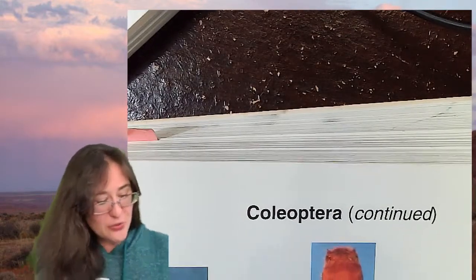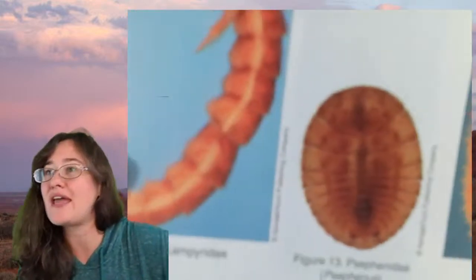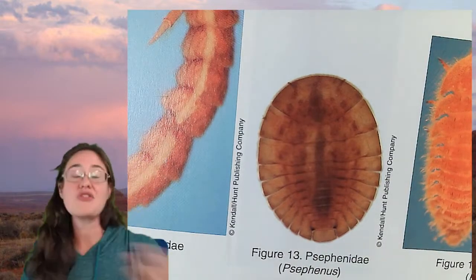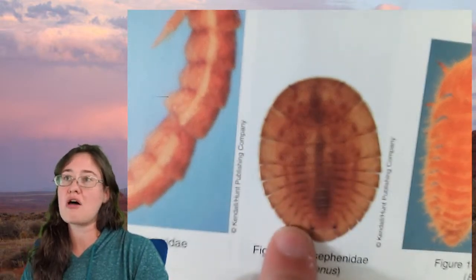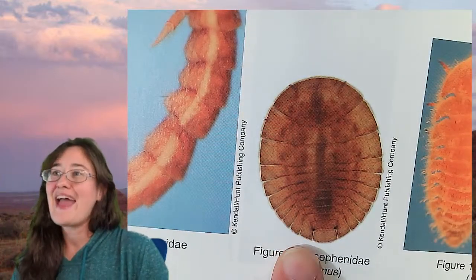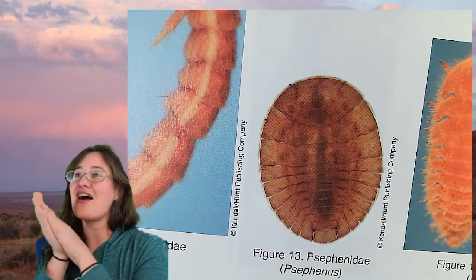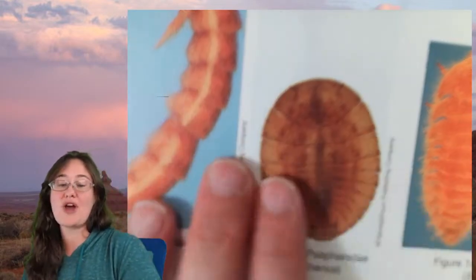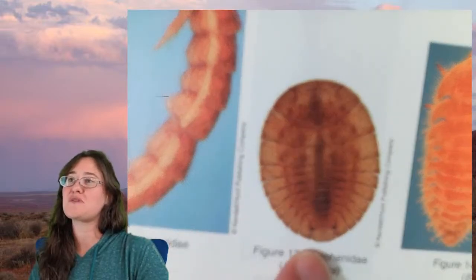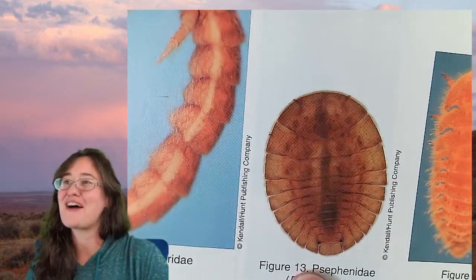So here's one insect that I've always found really fascinating. We're going to have to sketch him one day. He's in alcohol, so you didn't see him in the pinned collection. All the aquatics are actually in alcohol. They're not pinned. This guy is called a water penny, and they're super duper duper flat, and their body is right up against the rock. And if you flip them over, they do have legs, but all you can see from the top are these like wide scales. And they're a lot of fun.